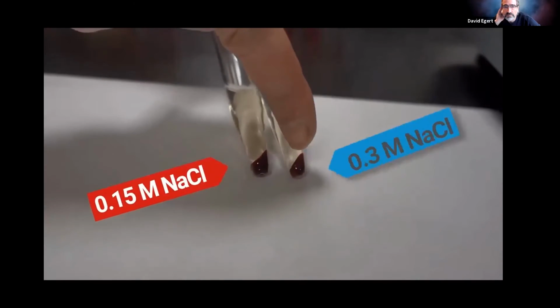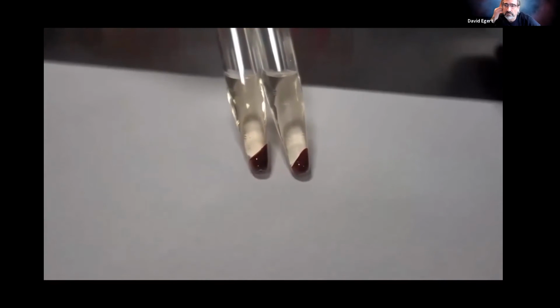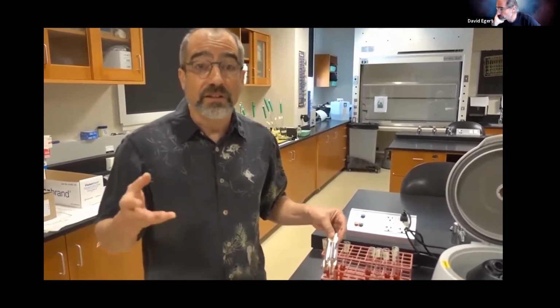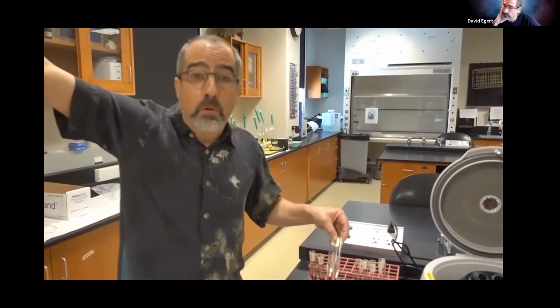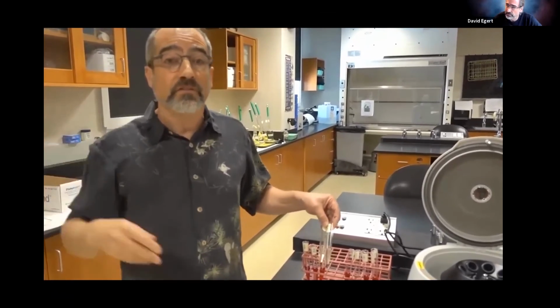And this is our first clue that these cells here probably crenated compared to these, because they're not taking up as much space for the same number of cells. And we're going to be able to follow up on that when we take them and look at them under the microscope. Obviously a crenated cell looks very different. It actually looks all shriveled up and spiky. You can see the cytoskeletal elements poking out against the membrane. They look kind of like, I don't know, pufferfish or something.